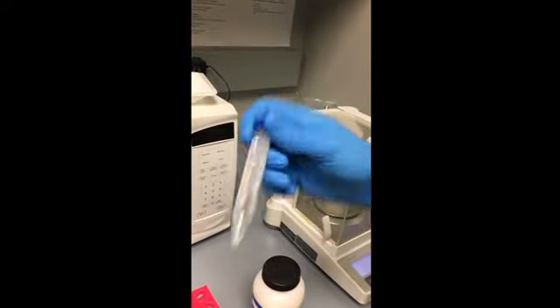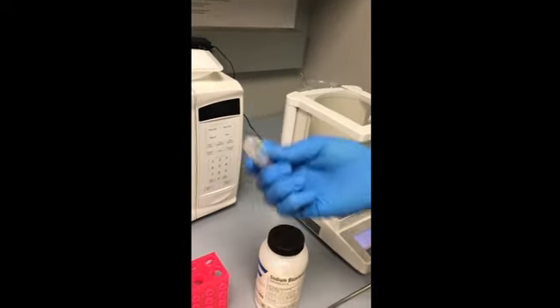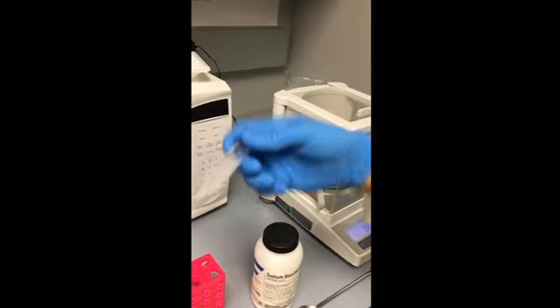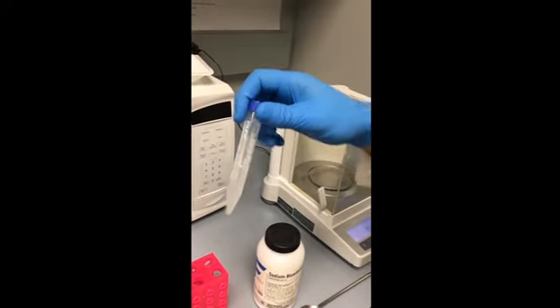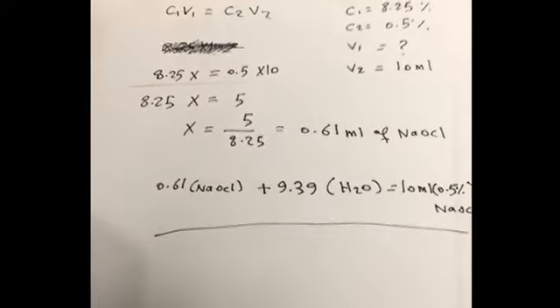The reason for using this solution is because it has pretty much no side effect and no damage to living tissue, instead of using something like hypochlorite, which has some effect on living tissue. So we're going to use sodium bicarbonate to adjust the pH. Okay, and in this step now we're preparing 0.5% concentration of sodium hypochlorite.